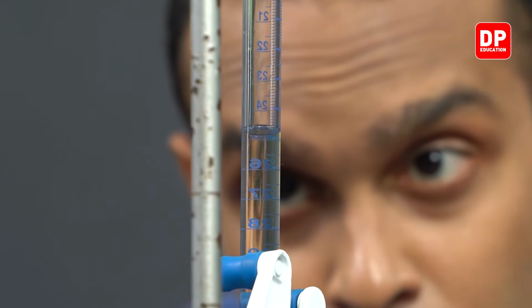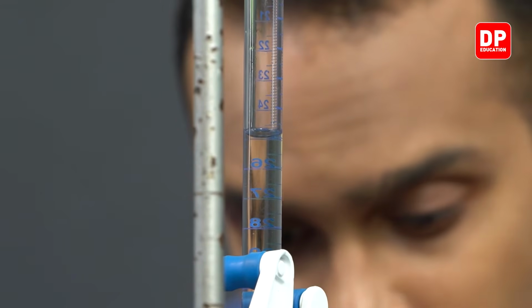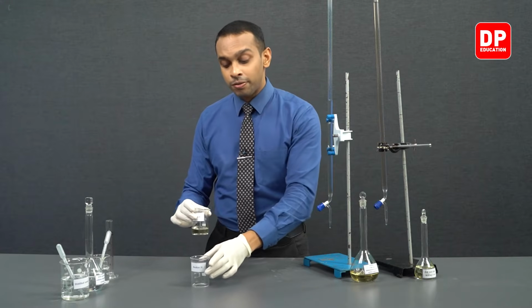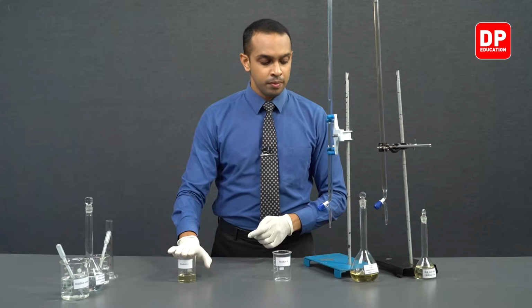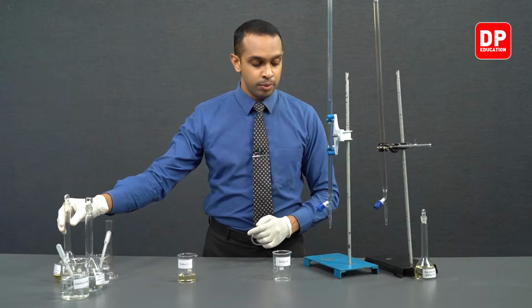Right, so exactly 25 cubic centimeters of acidified Fe3+ is measured into beaker 1. We'll keep it aside. And then, students, we can actually move on to the next burette.